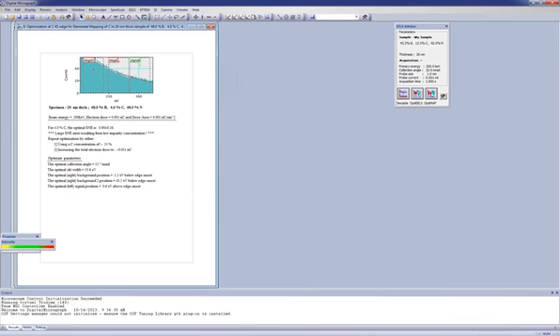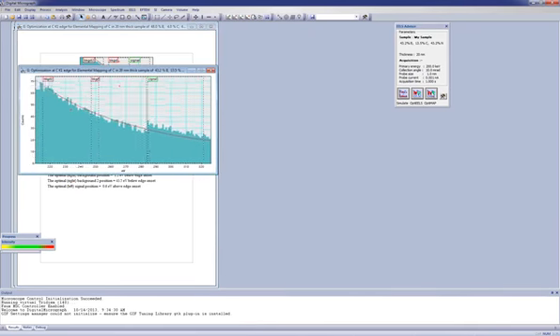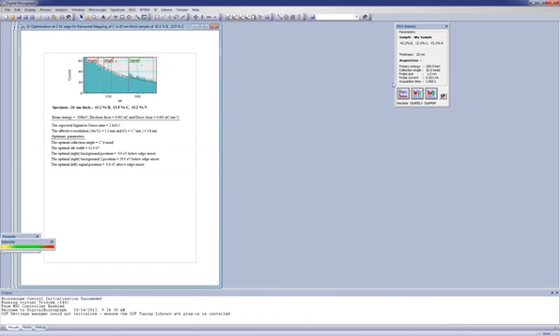So in this case, we can go back to the EELS Advisor palette and hit OptiMAP once again. In this case, the carbon K edge becomes clearly visible. It goes ahead and does the OptiMAP, and you can see the signal and two background windows present. And it computes the expected signal-to-noise ratio for mapping, the optimal collection angle, the optimal slit width, and the optimum right background position. So basically in this case you can see that the optimum solution suggests that the two background windows should overlap with one another.